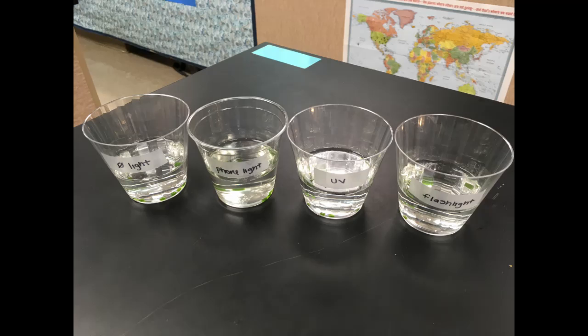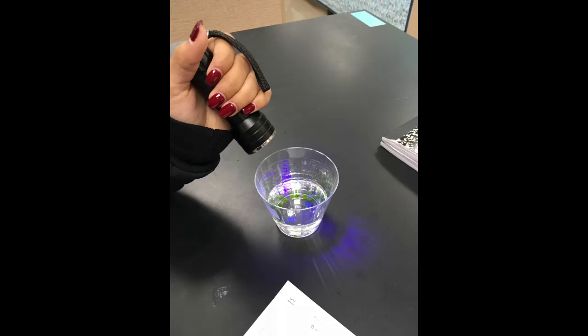So our experiment was pretty much the same as the one that we did in class with the spinach and the syringes and measuring the level of O2 production. Except the main difference, while everything else was basically the same, was that we were testing different sources of light and their effects on the production of O2.